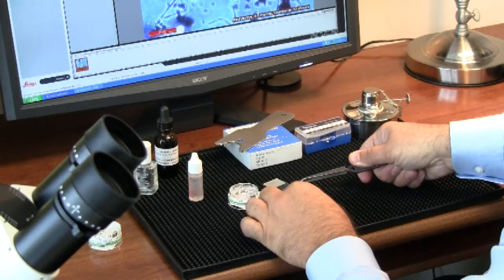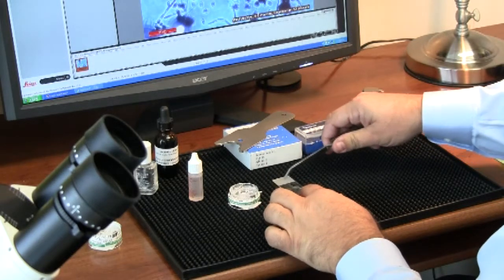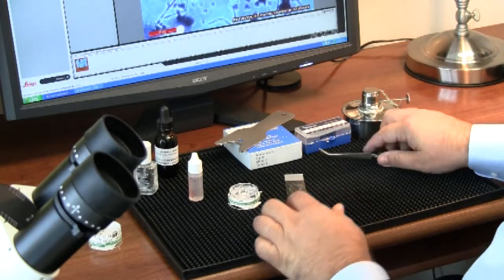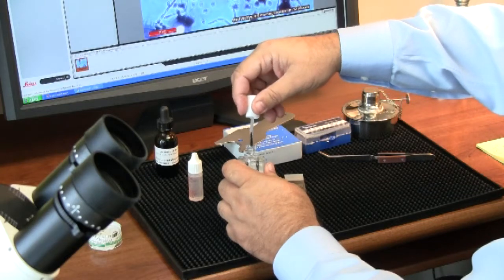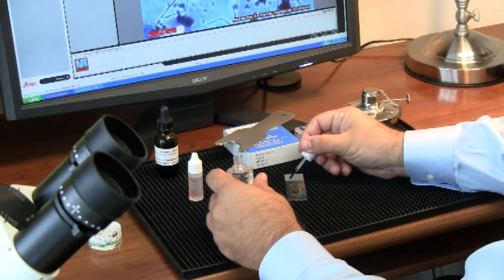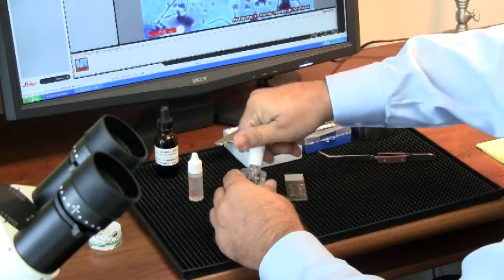We're going to set that down and square it up. Then we're going to use a little adhesive to hold it fast at the corners so that the slide won't move during usage under the microscope. You don't have to use four corners — two is usually enough.